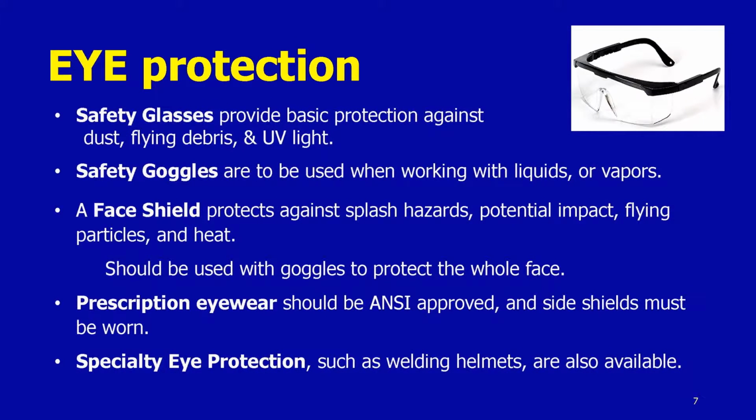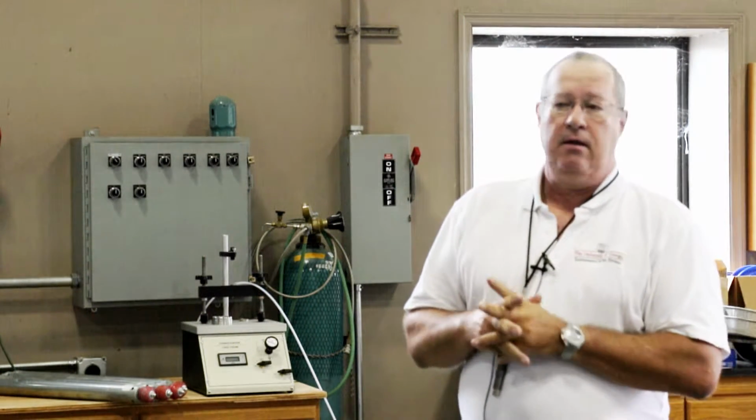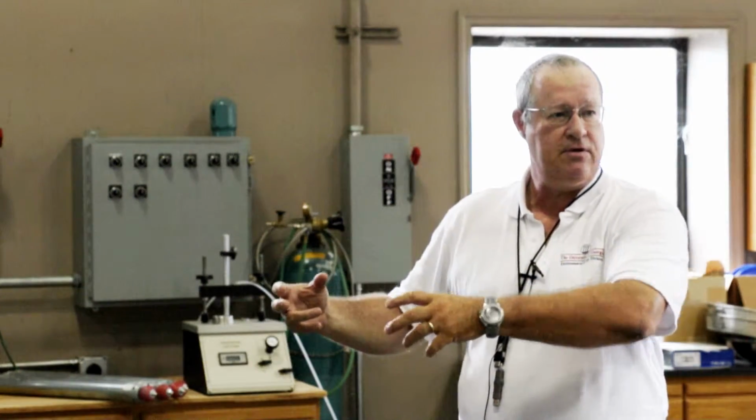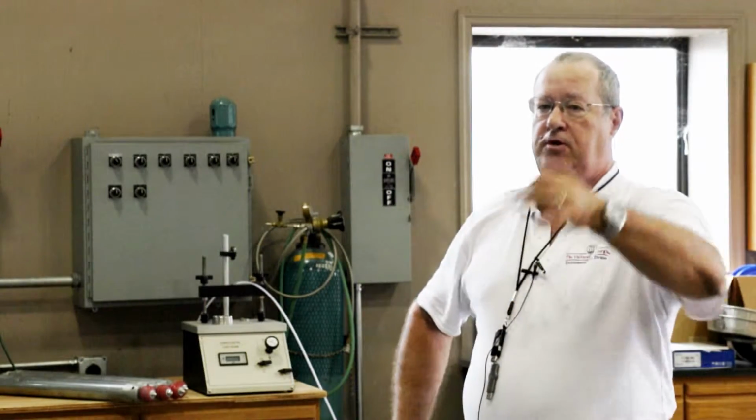Sometimes, if you're handling bulk quantities of chemicals, you might need a face shield. I was in a lab a couple weeks ago testing some hoods, and a young lady was doing an experiment with liquid nitrogen. She took some from a flask of liquid nitrogen and poured it into a small tube to do her reaction in the hood. She didn't have anything in the way of eye protection.